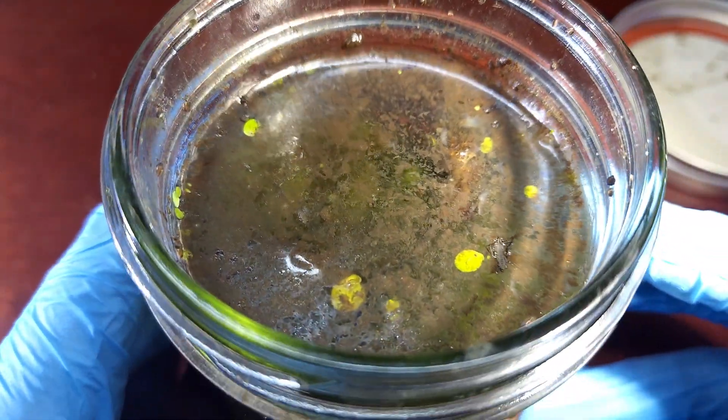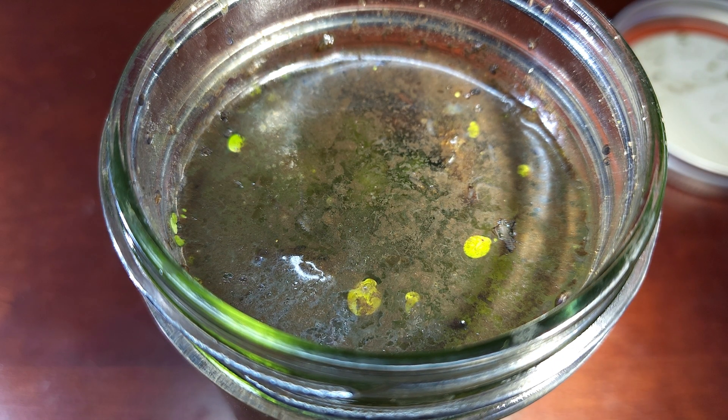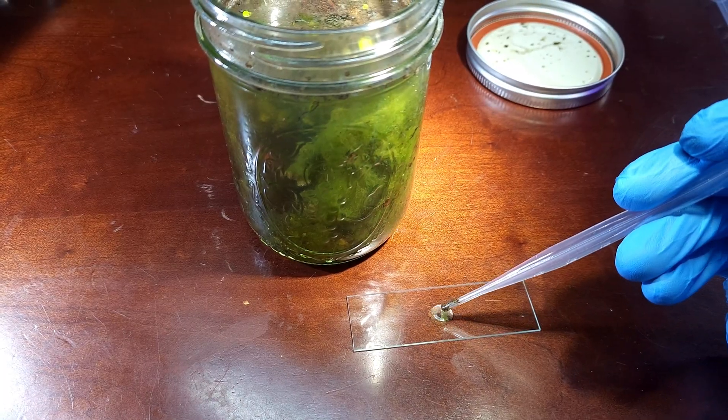For the videos I make on bacteria, you would do this exact same process and put the jar aside for around a week or two while the bacteria and other cells multiply inside. Eventually you'll get a thick biofilm on the surface that's full of different kinds of bacteria and microbes.